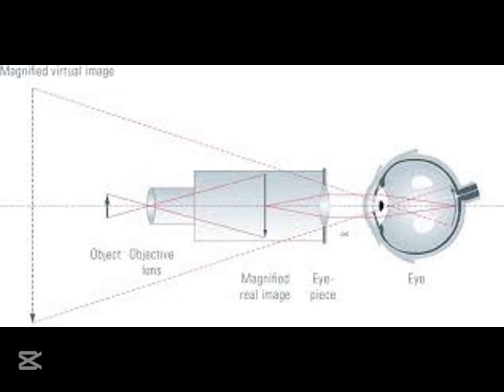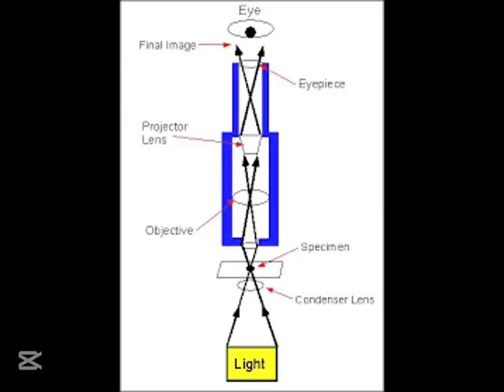Okay, so we've got the lenses, the stage. What else? Well, to see the specimen properly, you need light. Right, it's probably pretty tiny. That's where the light source comes in. It shines light up through the slide so you can see the specimen clearly. Like a little spotlight.